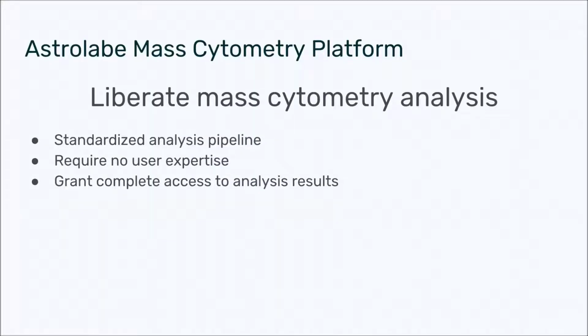One of the major goals behind the Astrolabe platform is transparency. As one of our valued users, we want you to feel confident in the analyses we provide and know that you can always get back to your data and your results. You have complete access. In this tutorial, I examined the 3 exports that help us achieve this goal: the gated FCS files, reports, and R files.